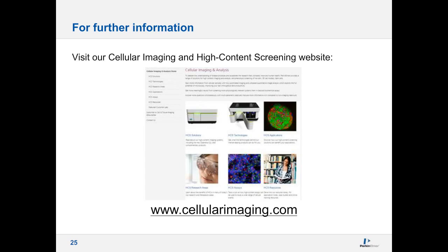One is the water immersion objectives that really help you to get deep into the tissue without distorting the image. And the second thing is the design of the spinning disc. The Operetta CLS has a classical spinning disc design without microlenses and a pinhole spacing of about 250 micron. And in that case, we typically see a depth of up to 50, 60 micron, maybe sometimes a little bit more than that, where we can still successfully segment all the nuclei in a given plane.